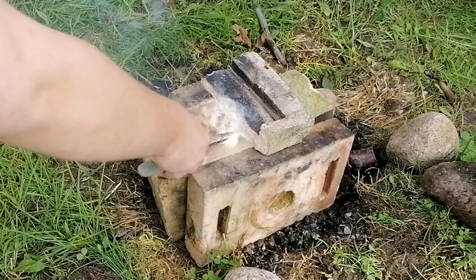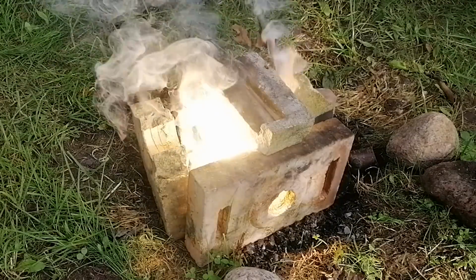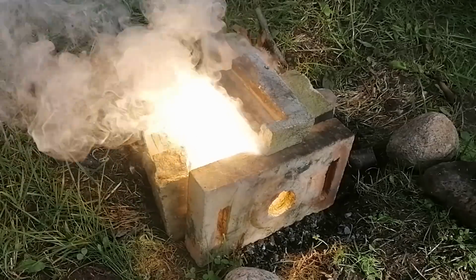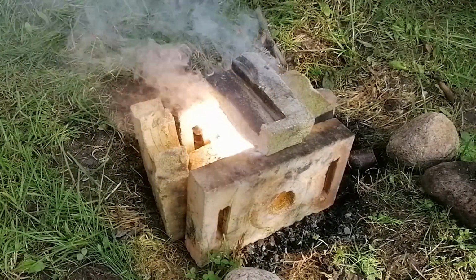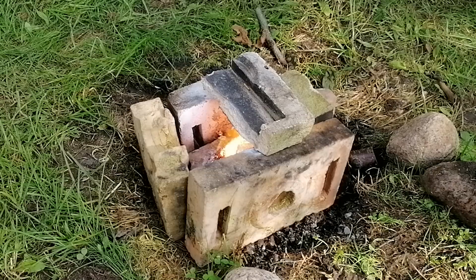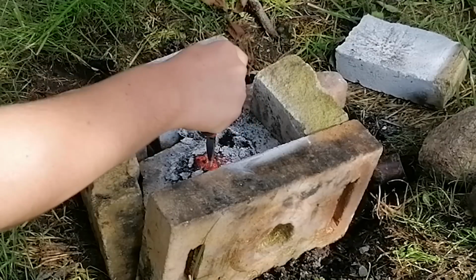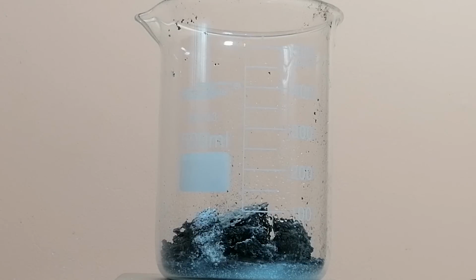It starts off really slow, but then it takes off, just like your usual thermite. Wow, this was so cool. I can't believe this. Anyway, I went in and started breaking up the boron magnesium oxide pile, and I waited for it to cool down. So anyway, this is the slag from the reaction, and I'm adding enough water to cover up the entirety of it.